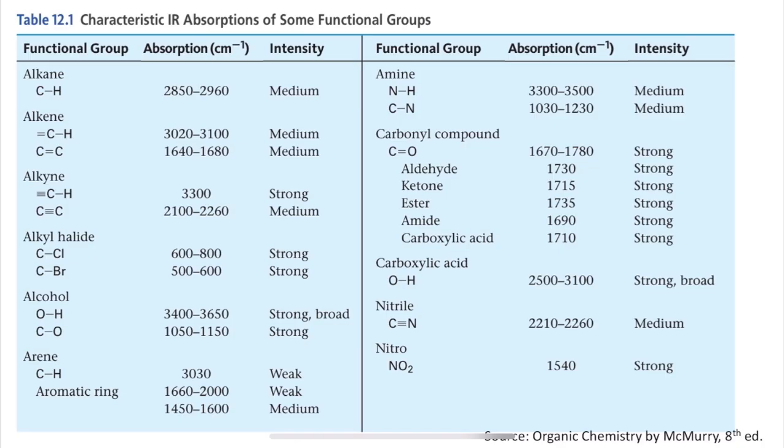This slide shows a longer list of the types of bonds and their corresponding wave numbers. You might want to pause the video to take a longer look at the table and probably take a screenshot of it for your reference later on.